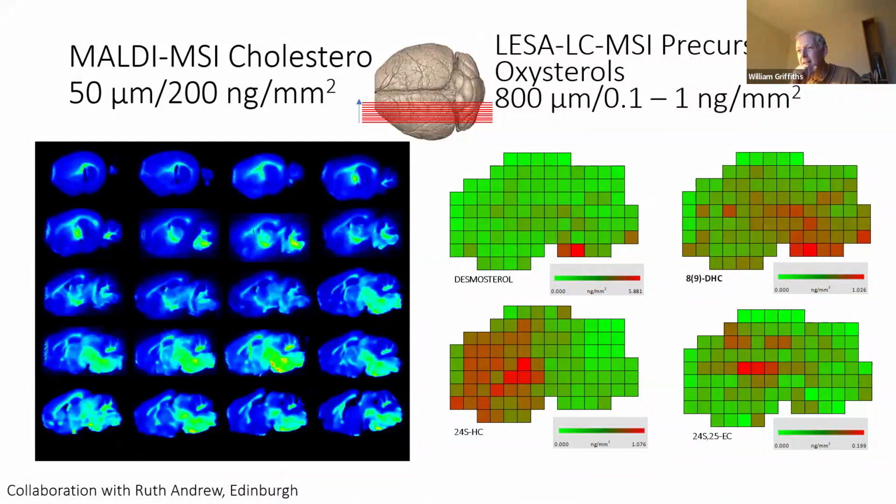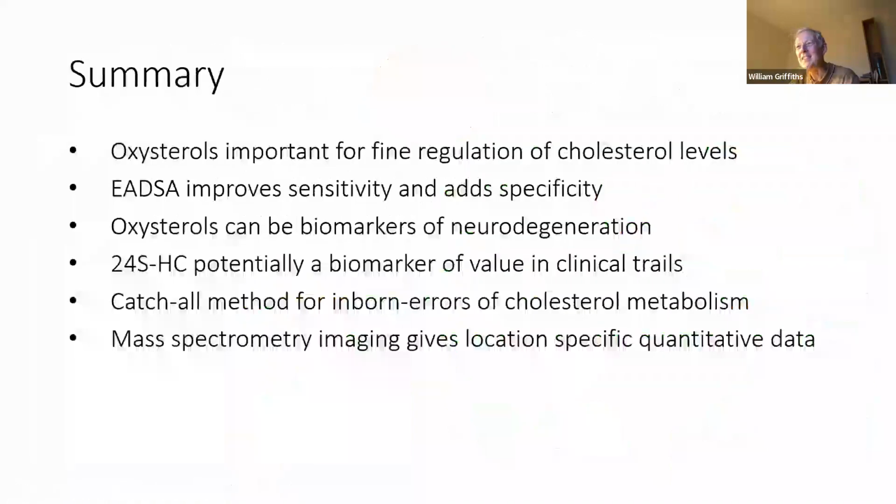This is quite a lot of work, and for each of these pixels, it takes about an hour of mass spec time. So you can imagine going through the whole of the brain. It's years of work. So this is a big study. That's more or less it.